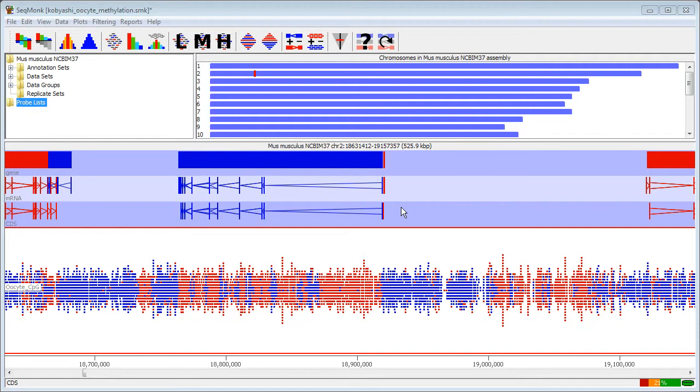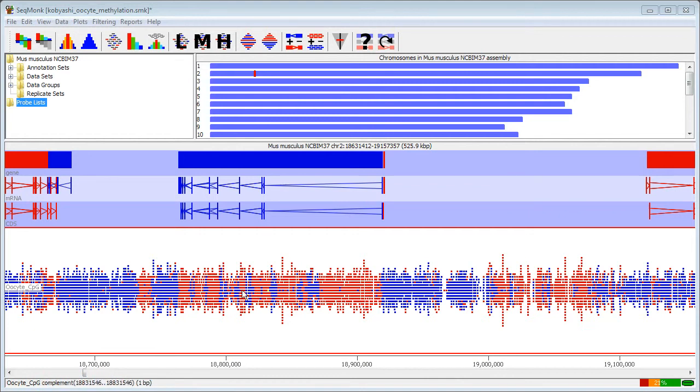To demonstrate this I'm going to draw a quantitation trend plot around genes and measuring, in this case, methylation levels. So I've got a CPG methylation track here and I'm going to quantitate this around genes and then draw out the profile of this methylation over all genes.